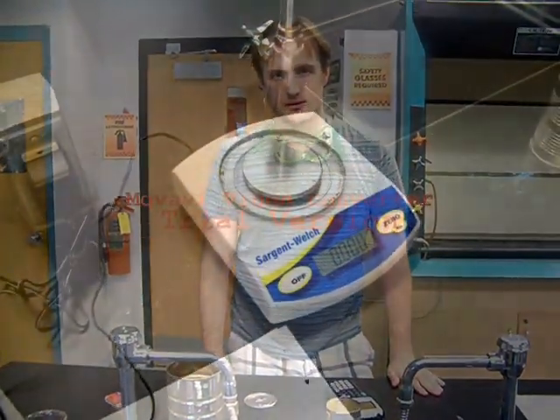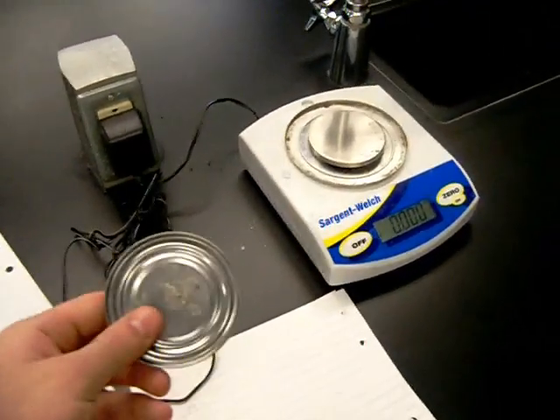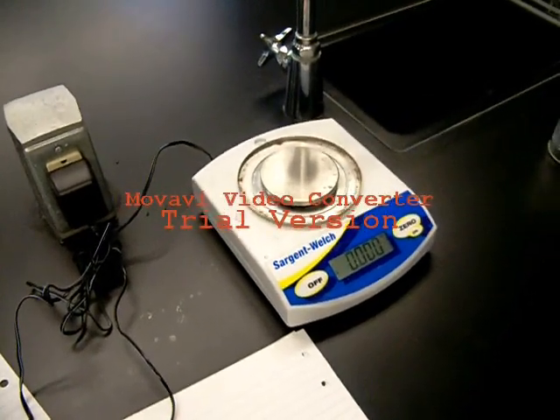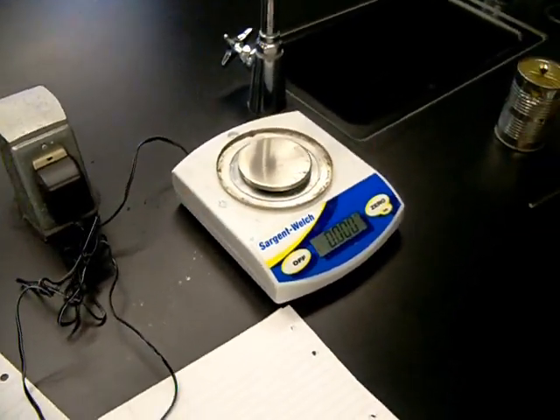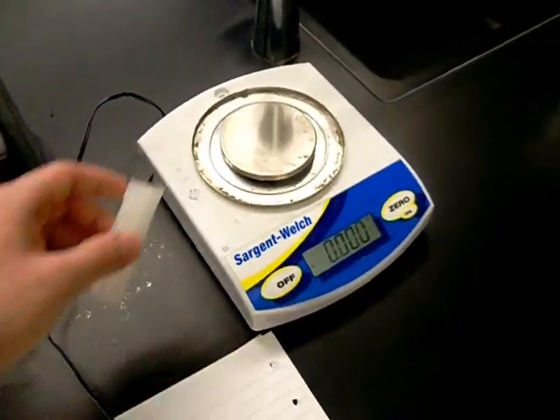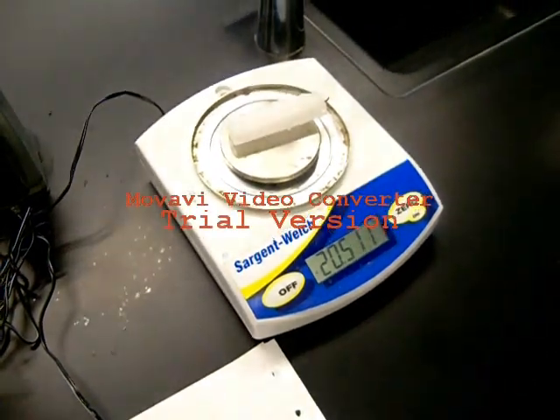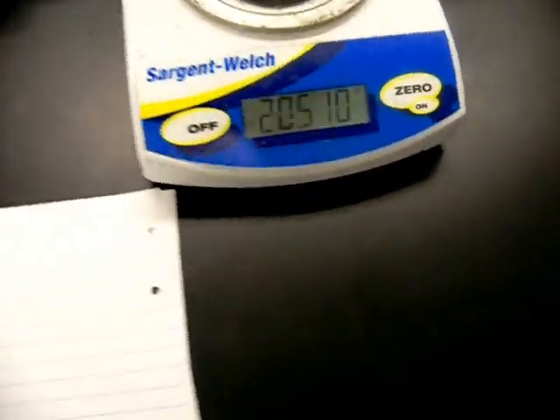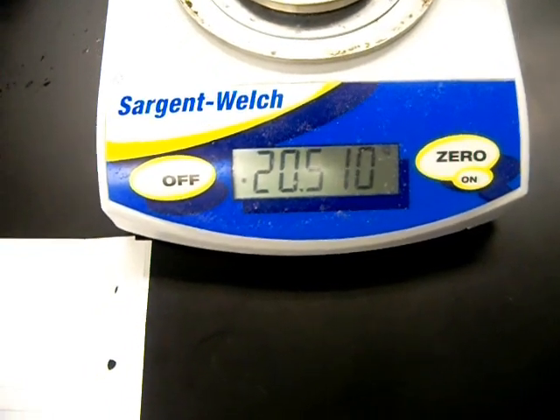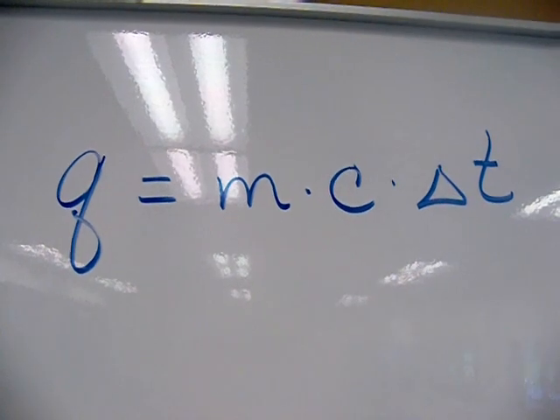This is an electronic scale. We need the mass of the candle, and we also need the mass of the tray here so it can catch any droppings when we burn the candle. We can use this to find the actual heat gained and lost by the water when we burn the candle. And the mass is 20.51 grams.